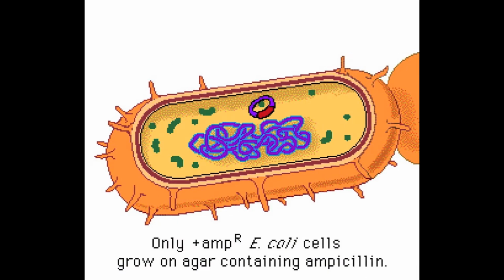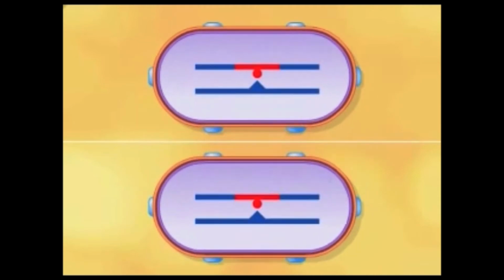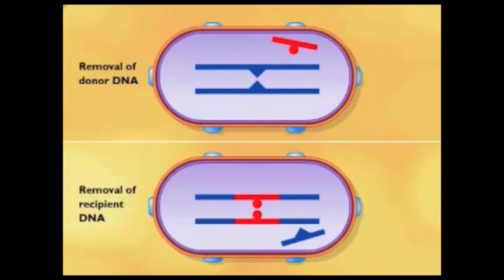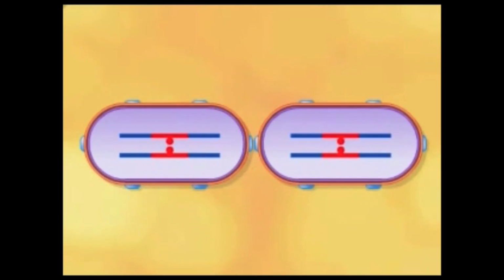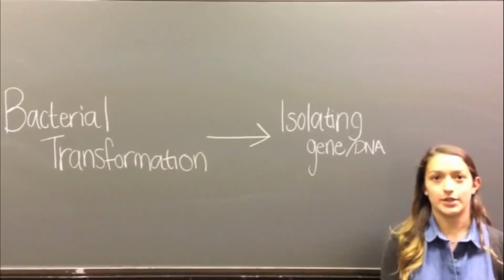The main concept to understand is that during this process, bacterial transformants are taking in foreign DNA with a specific gene and a survival gene through pores created in their cell walls. If done successfully, the cells, when plated, will grow and express both the survival and specific gene. You must grow the colonies and isolate a single colony with the DNA from the bacteria. We hope you now have a better understanding of bacterial transformation.